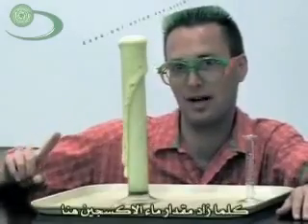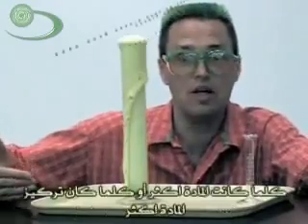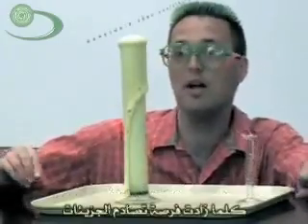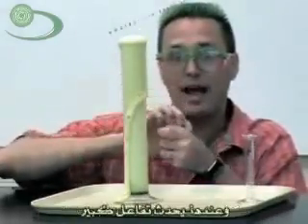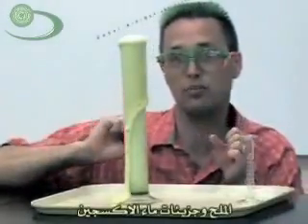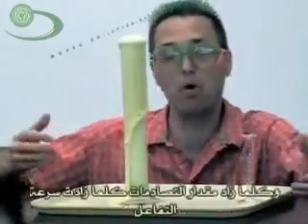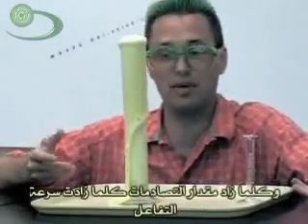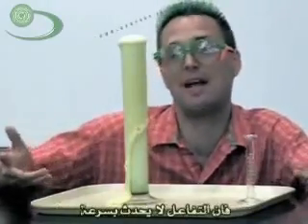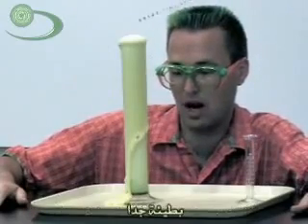The more hydrogen peroxide that's in there, the faster this should happen. That's one of the things about concentration. The more of a substance, the more concentrated a substance, not just how much it is, but more concentrated, the more likelihood that two molecules will collide and then have a reaction happen. So in this case, the salt and the hydrogen peroxide molecules will collide, and then you get a reaction. And the more likely they are to collide, the faster the reaction will happen. And since we have less concentrated hydrogen peroxide in here right now, it doesn't happen very fast. Well, this is still moving kind of slowly, very slowly.